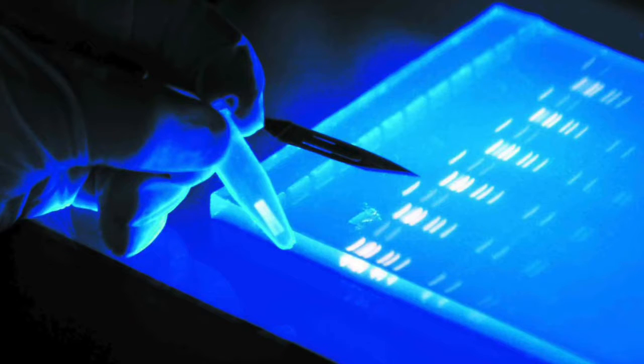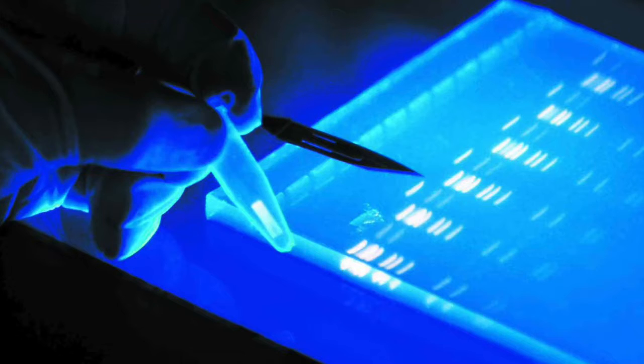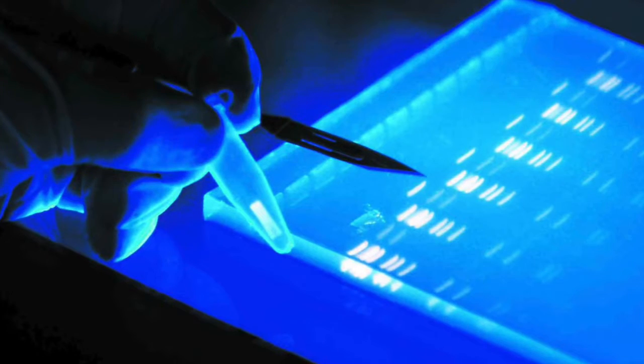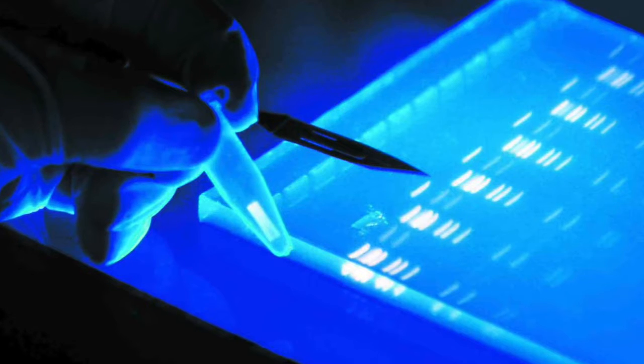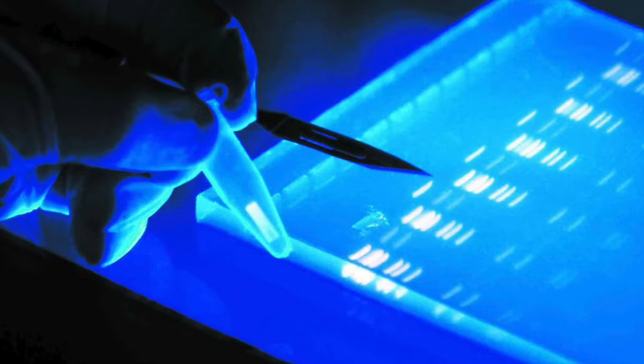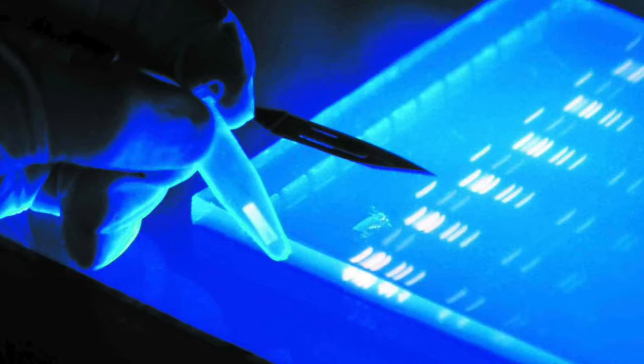The final step is electrophoresis. DNA is inserted into wells found in agarose gel. An electric current is charged through the gel, which causes the DNA fragments to move. Negatively charged fragments migrate to the positive end of the gel. The fragments are then separated by size for further analysis.